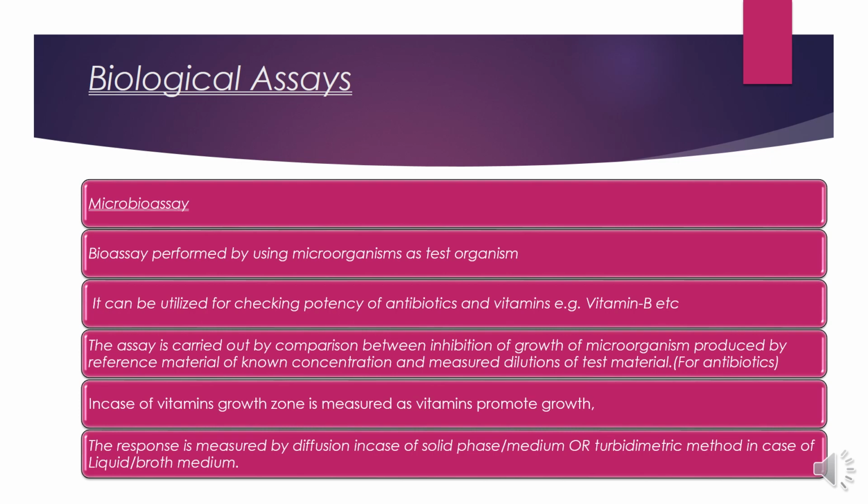So both are opposite in terms of the responses. The antibiotic is used to inhibit or kill microorganisms, whereas vitamins are growth promoting agents in humans as well as in certain microorganisms. They need vitamins for their growth, so vitamins can promote the growth. So the response is somewhat opposite if you are using antibiotic or vitamins.